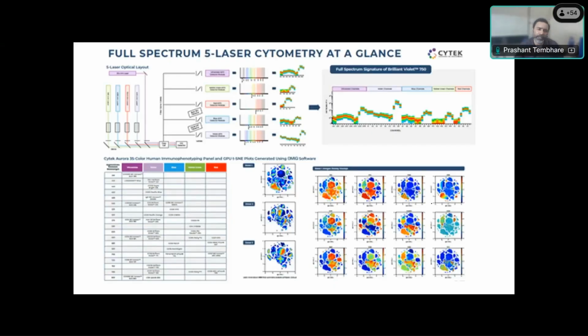The more used is the flow cytometer, full spectrum flow cytometers. Now they are available in almost the majority of major centers of the world. Many centers in US and Europe have full spectrum flow cytometers. Even our center, Tata Hospital, has a spectral flow cytometer. But the majority of centers are using spectral flow cytometry for research purposes, mostly for immunological work etc.